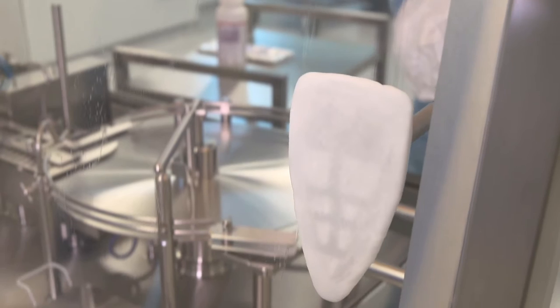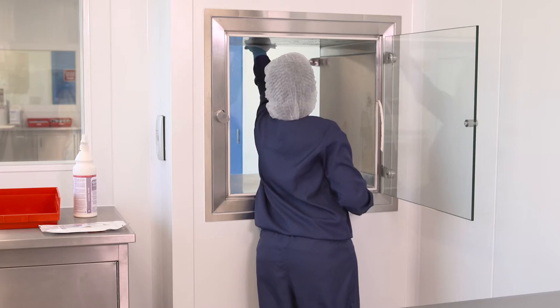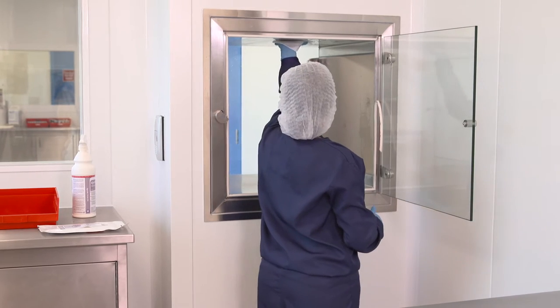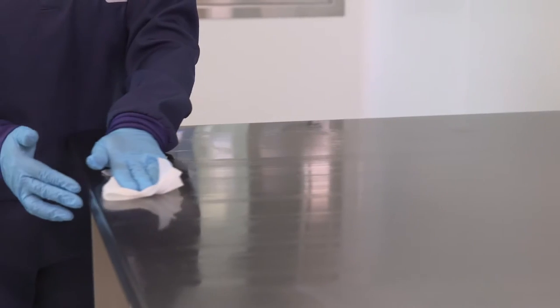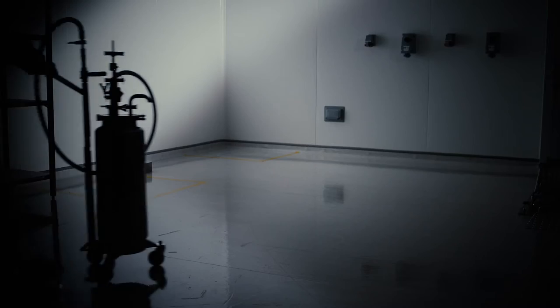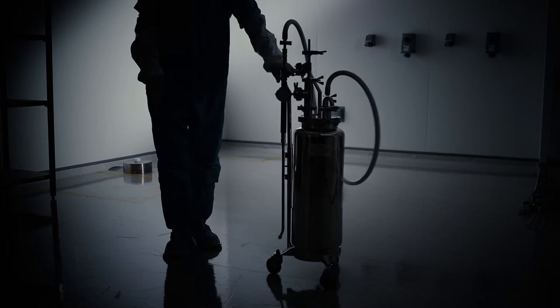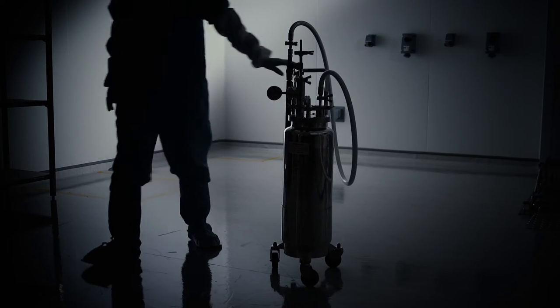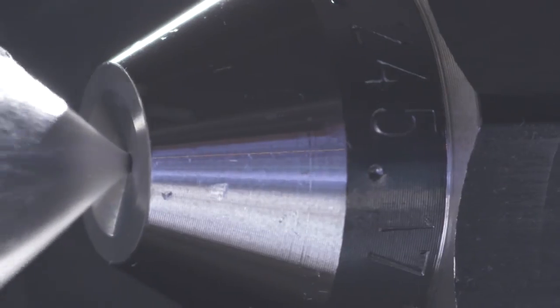This takes significant time, which delays shift changes, reduces available manufacturing time, and adds significantly to labor costs within the plant. Recognizing the multiple pressures clean room managers are under to do more with less, Ecolab have created an improved new method.